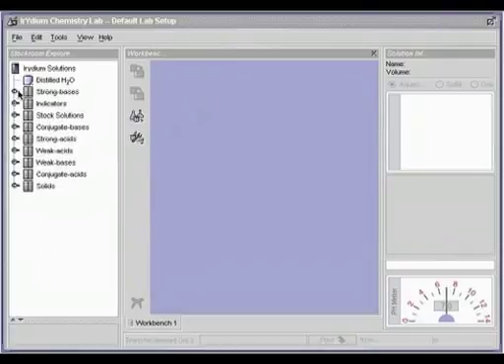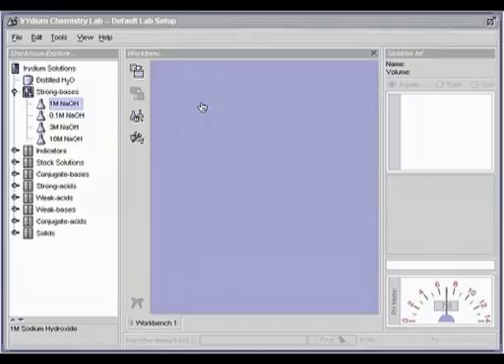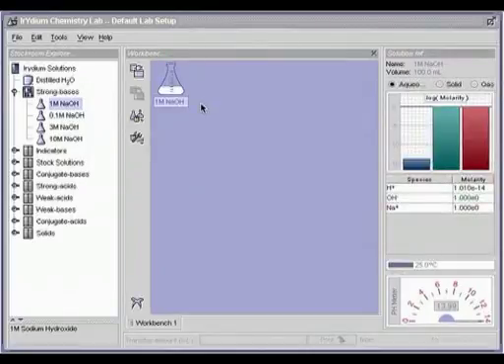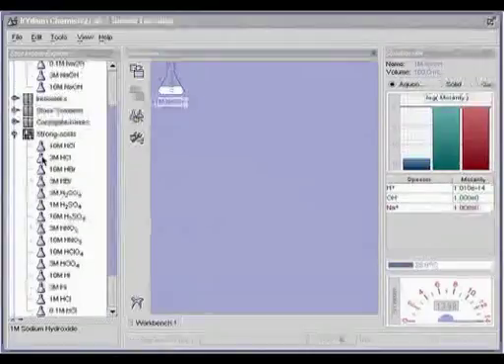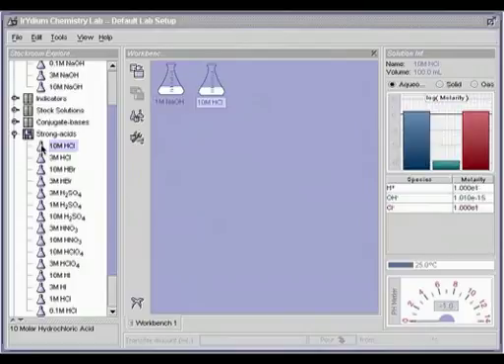To bring a solution out of the cabinet and onto the workspace, click on it and drag it onto the workbench. You can also double click on it or select it and click the retrieve button on the action bar.